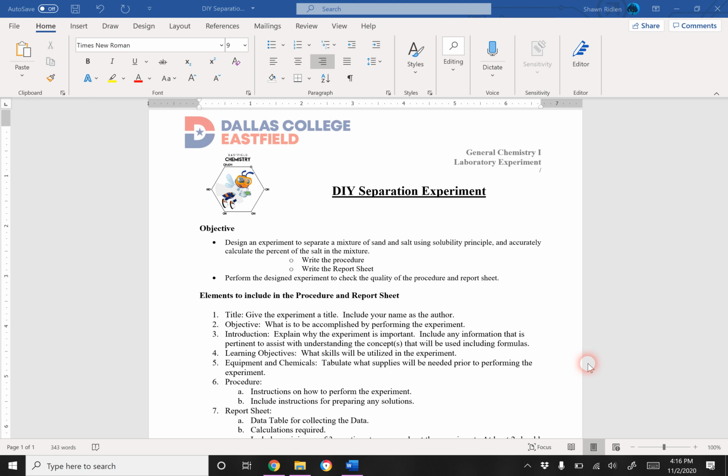which just means slowly pouring the water off the solid and leaving the solid behind. We could do it through filtration and then drying. Somehow we need to separate the soluble product from the insoluble product, and that can be through filtration, as I said, or decantation. There are lots of ways we could do this. But once we have those two separated, how do we get our salt back?